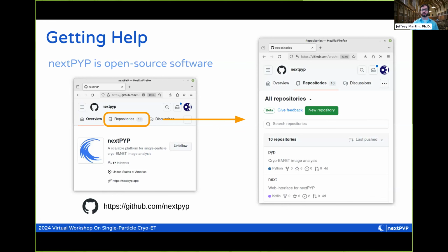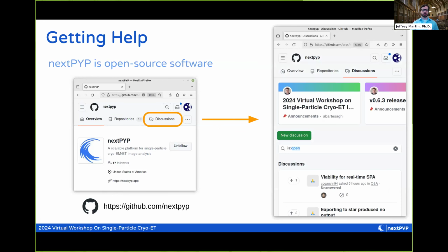And as Alberto mentioned before, we have a very permissive license. So not only can you read the code, you can compile it, run it, do whatever you want with it. We like to share. Okay, but the other part of this GitHub section is the discussion section. And this is where, so far, probably the primary place people have been asking for help with the software.